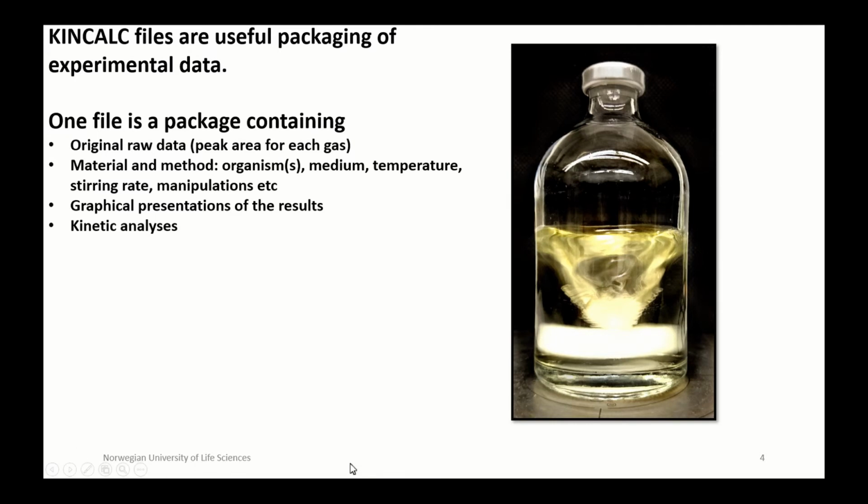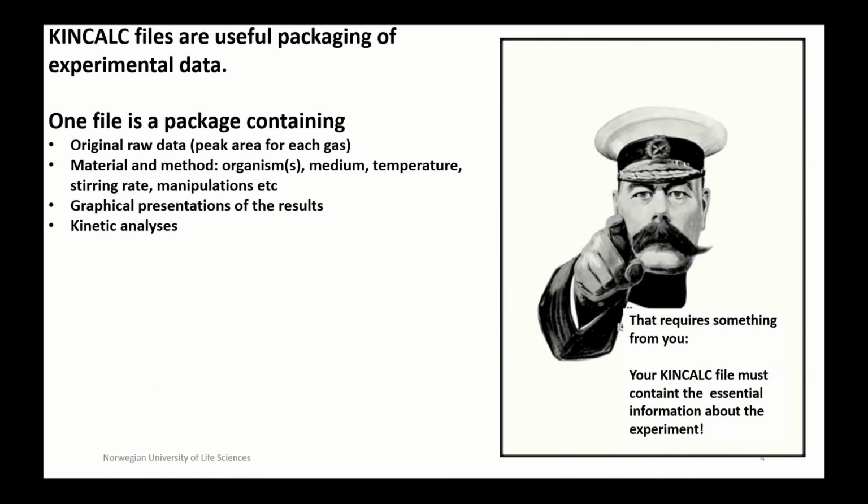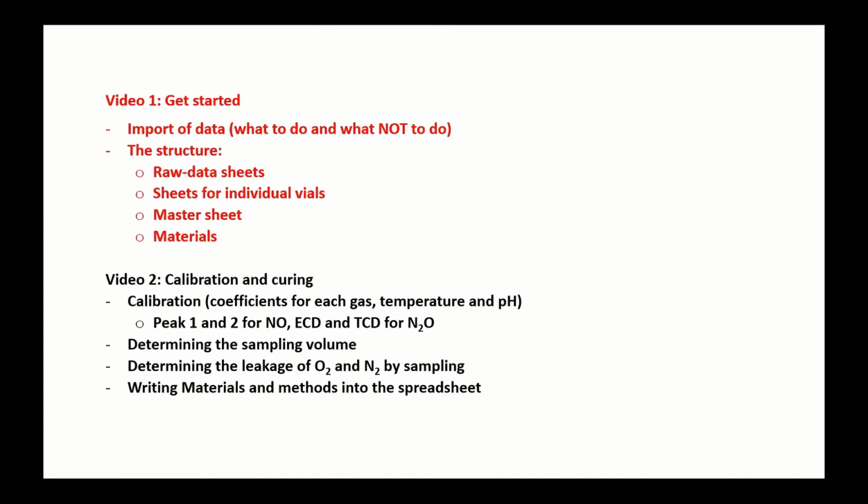And that means that you must secure that this KINCALC file contains the essential information about the experiment, which is not coming automatically. I will come back to this after a while. This is what I will go through in this video and what comes in the next. You can stop the video and read if you like. I will start with instructing how to import the data and what you must do.